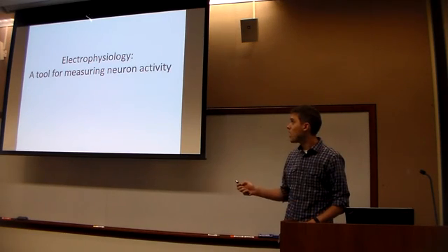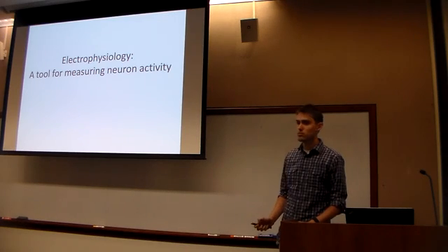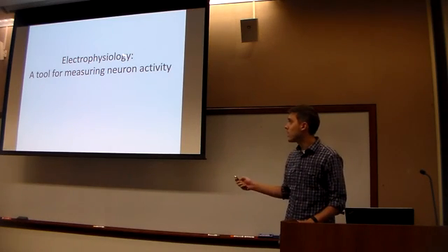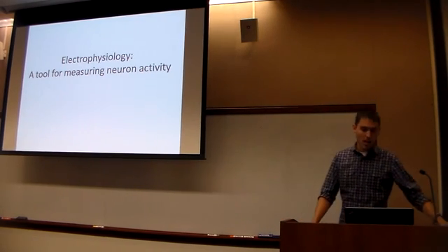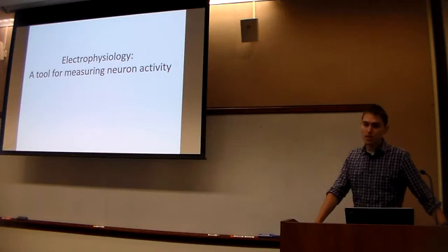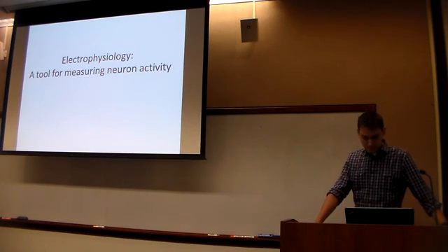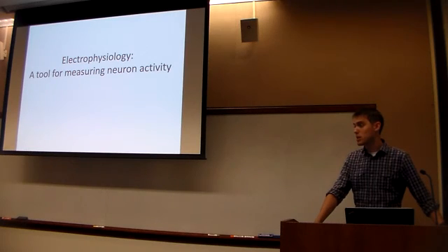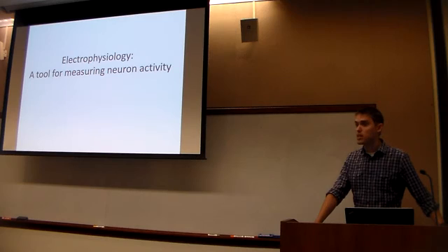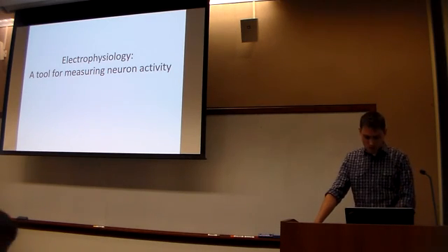It's a tool called electrophysiology, so electro for electricity, and physiology for body function. That's what people talk about when they talk about physiology. It's all about how the body works. And after this, we're going to be using electrophysiology to study touch responses in cockroach legs. So first, just a little bit of a review.